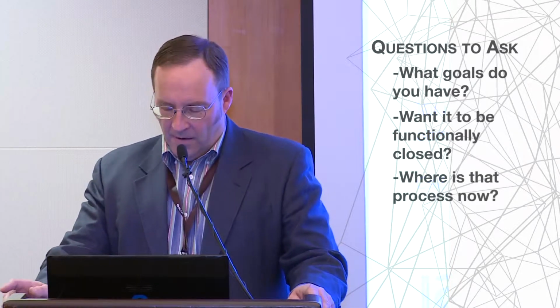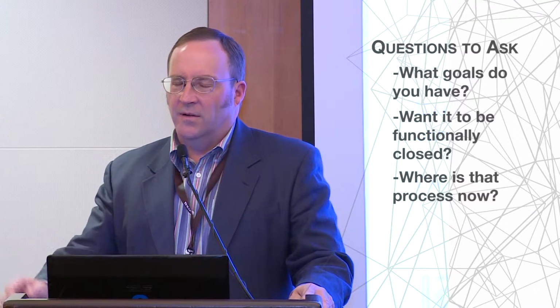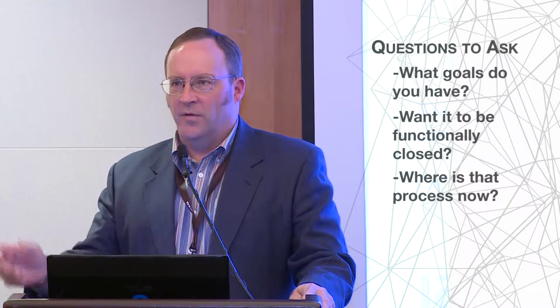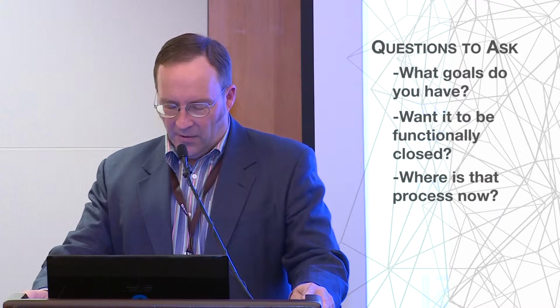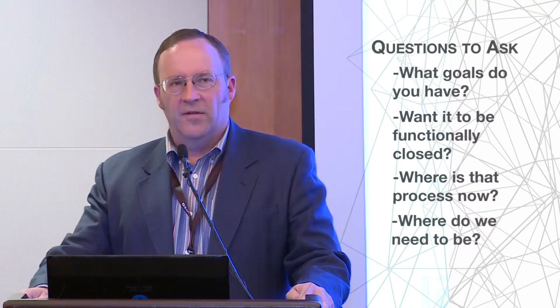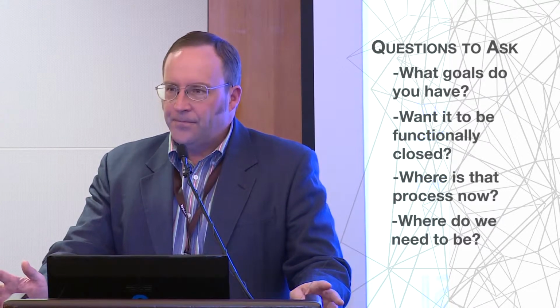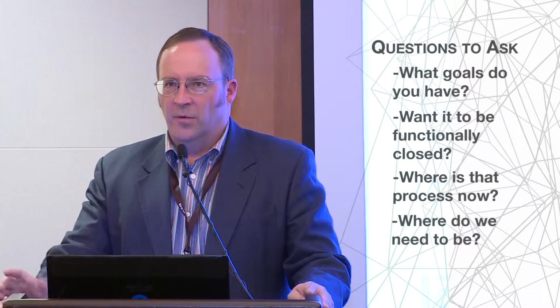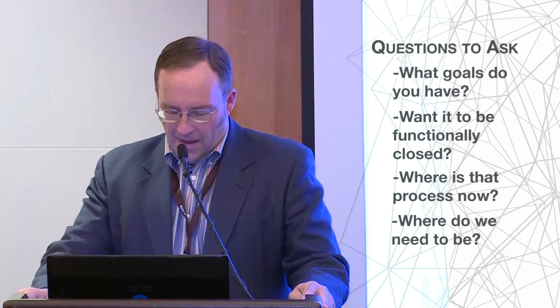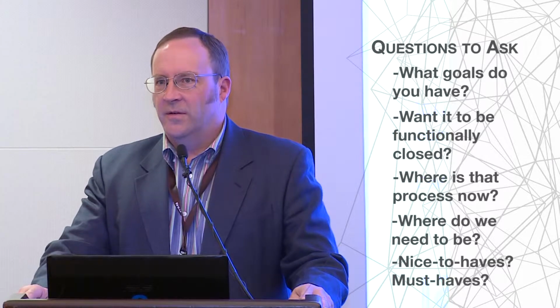Where's our process now? It's likely to be a manual process done by highly skilled operators in an open form, in a biosafety cabinet in a clean room. Where do we need to be? What sort of process development has to happen to take that process to something that is affordable and consistent and repeatable? What are the nice to haves? What are the must haves?